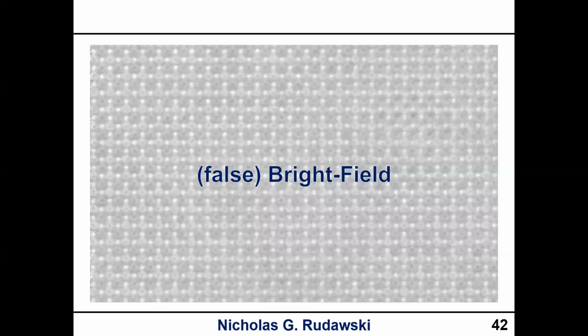Okay, so from this, we're going to transition to what I call false bright field, and I will freely admit that I came up with this term, false bright field. The majority of the literature simply calls this bright field, but I don't agree with that, as you're going to see here later on. I prefer to call this false bright field to delineate it from true bright field, as we'll see a little bit later.